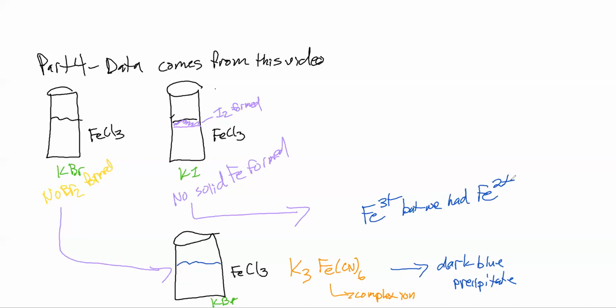And I was able to find a test where they do it just with Fe3+ and Fe2+, so you can see the difference in the response when they add this ferricyanide. So you can try that out and see what that looks like. Now, the tricky part is they also do it with ferrocyanide, so you just want to make sure that you're watching the right part of the video. But they actually go through an explanation about it as well. And this was put on by Flinn Scientific.